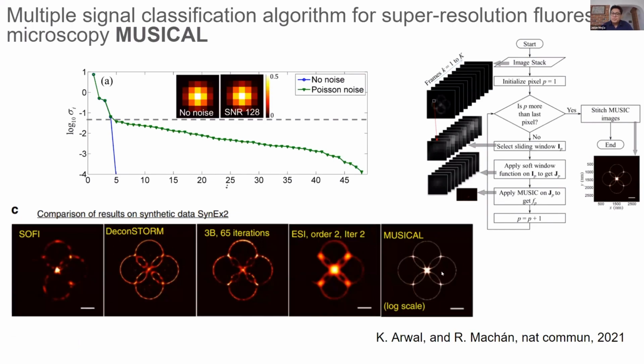But to make this interesting, I would like to draw your attention to the center. It's clear to us that you have 4 circles that are intersecting, but in the center, you cannot see a thing. You just see a bright spot, which I will say all of the other samples also fail to do that.